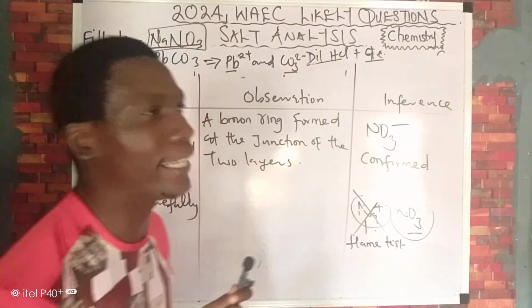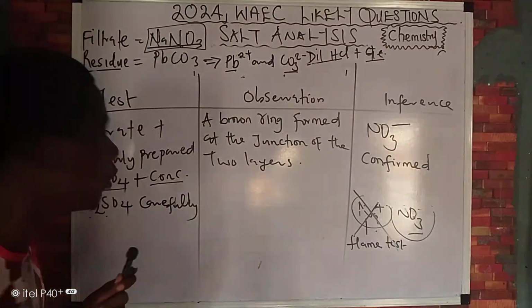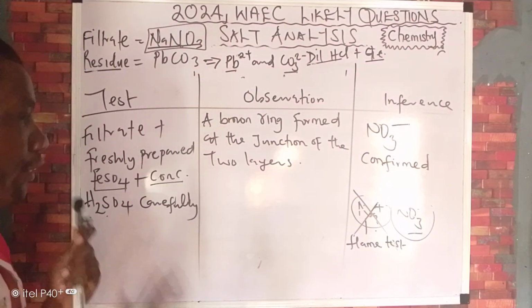So this is what we can do for the filtrate. The one that is longer is the residue, okay? So finally, we have come to the end of today's video lesson.